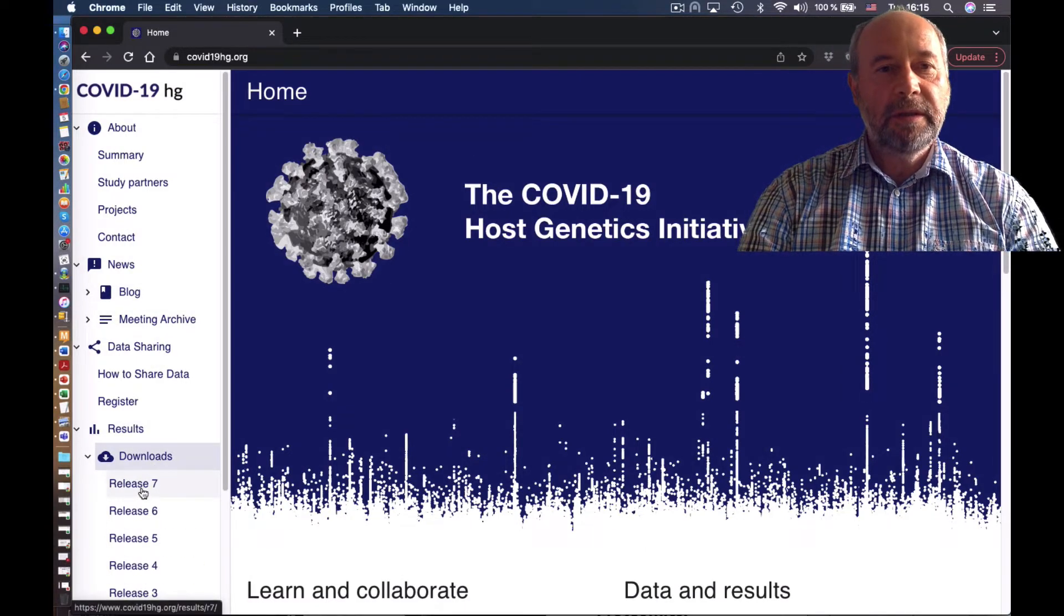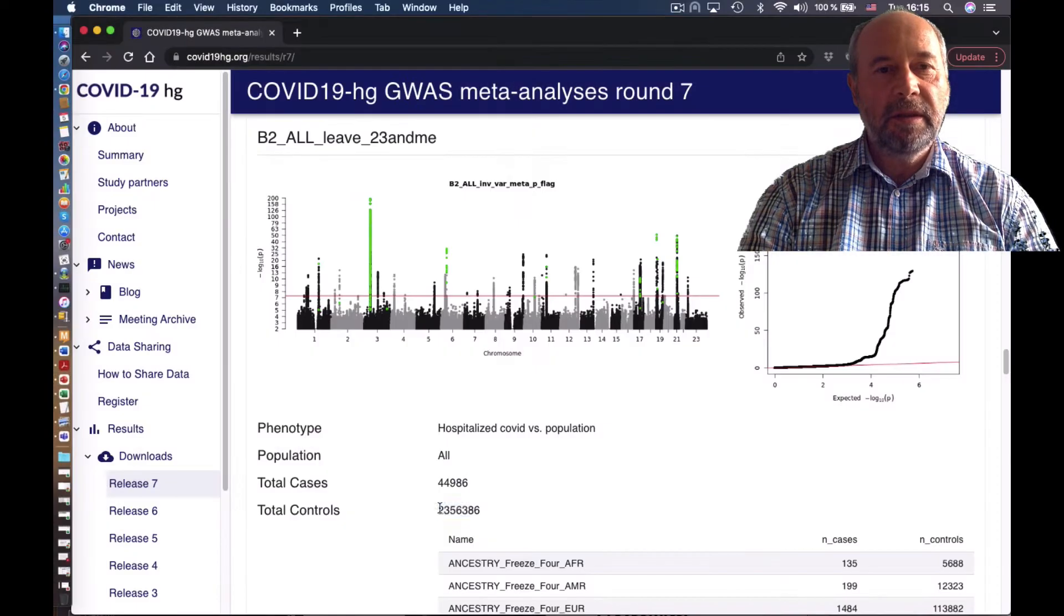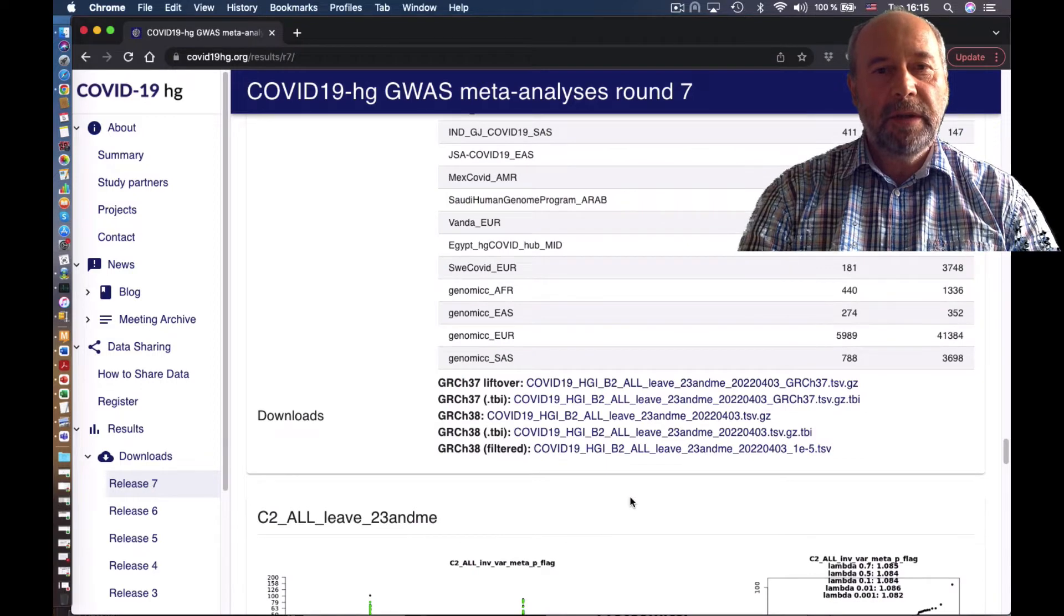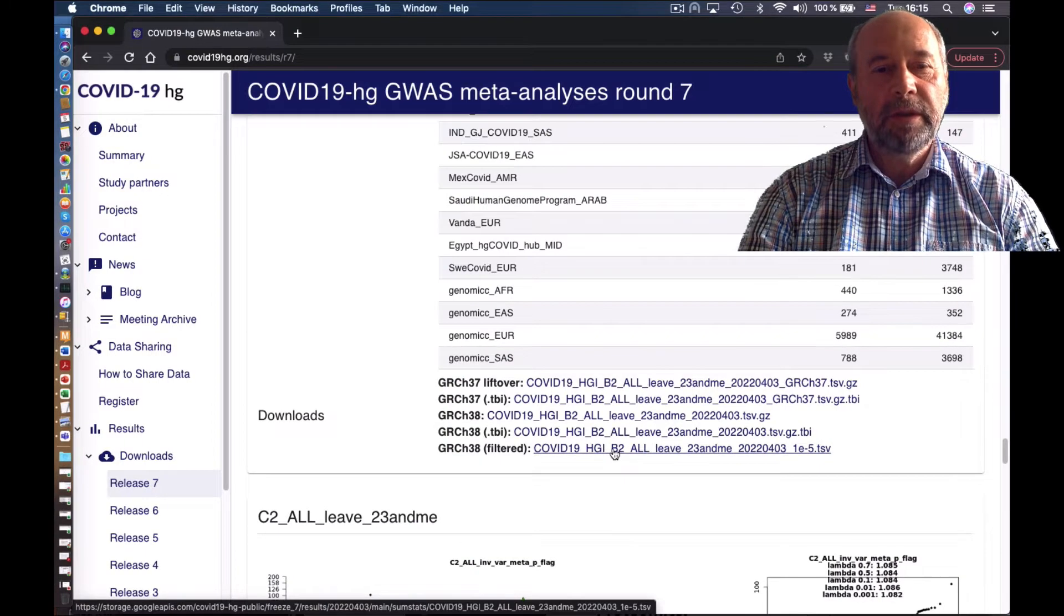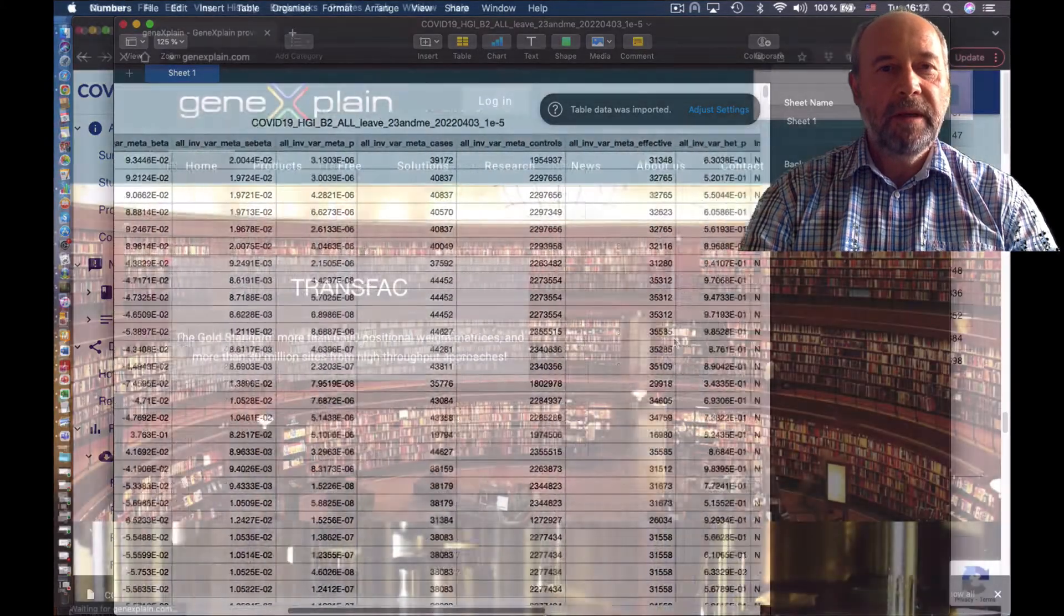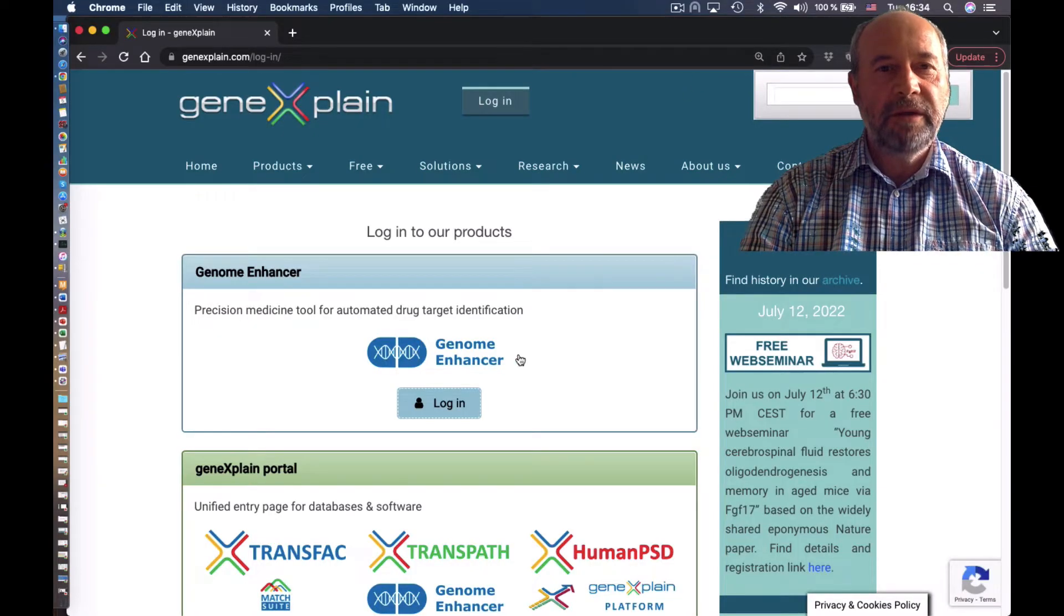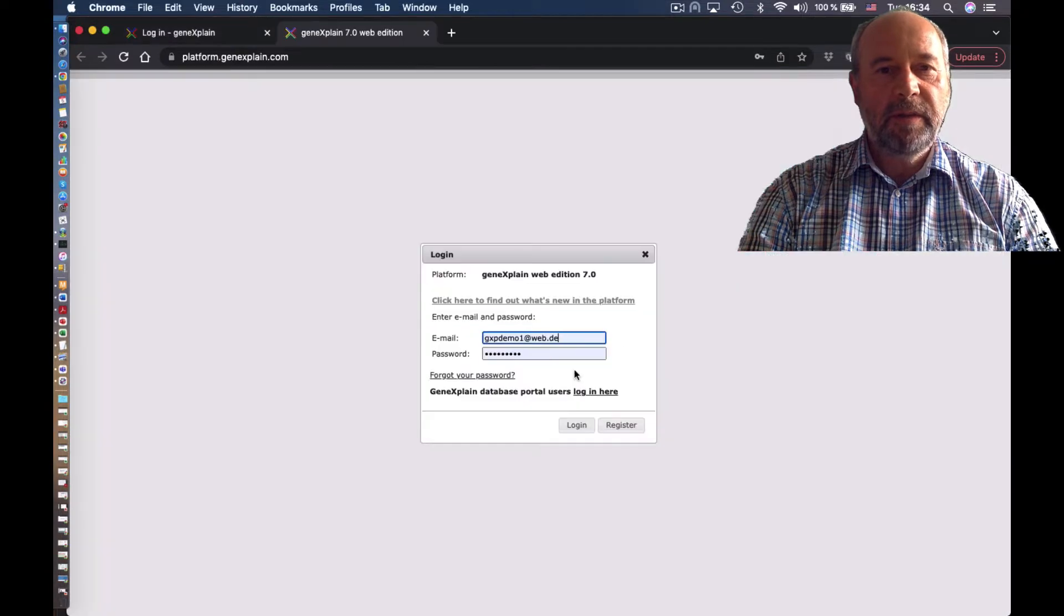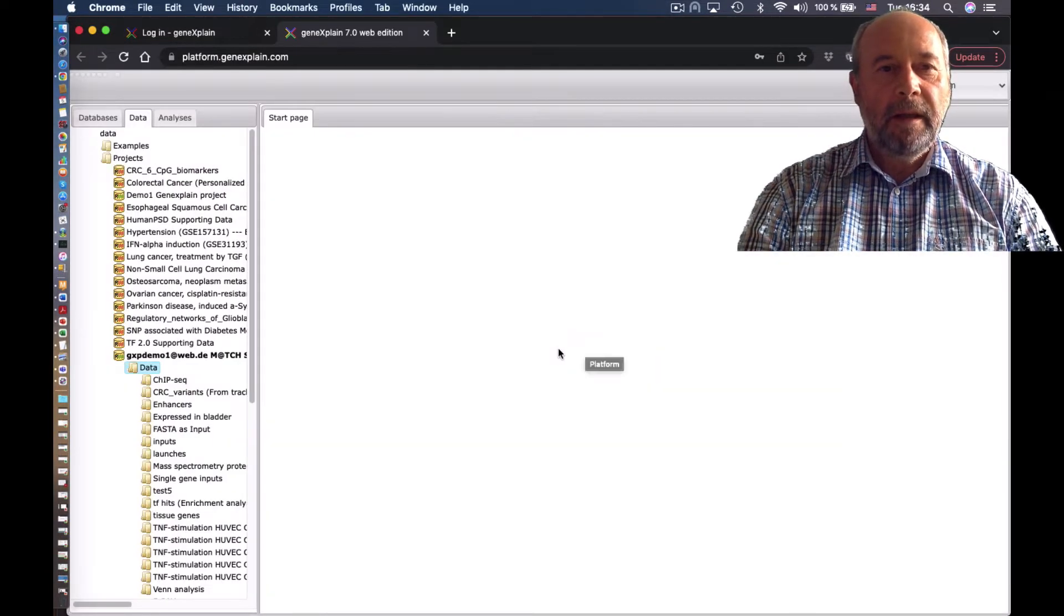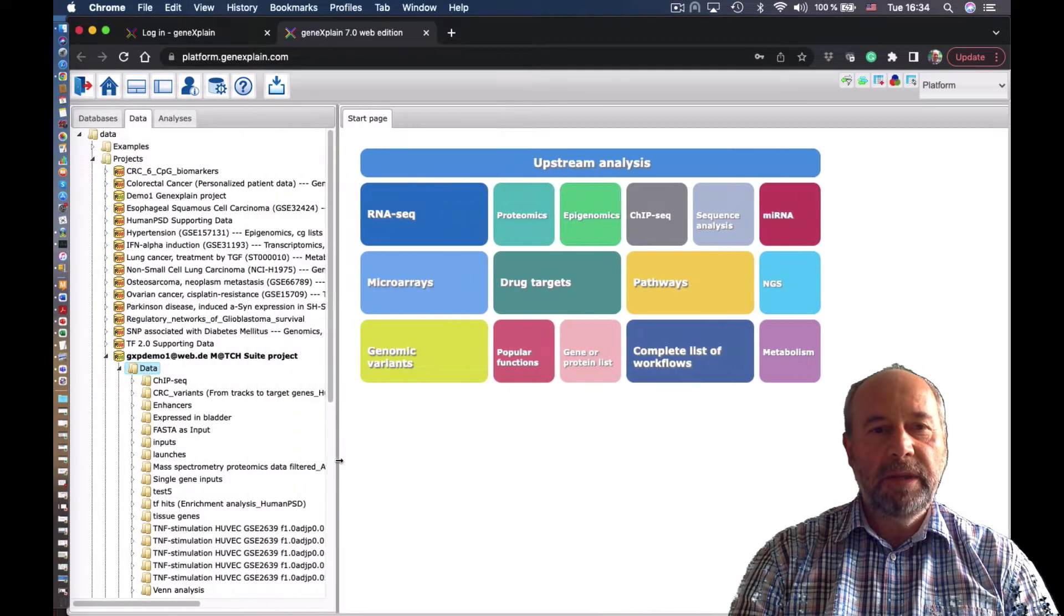So if you look at the SNP database, we definitely see this position, this SNP. We can download this data from this database and put it in for analysis into our platform. Basically, we use Transfac, we log in, and now let's have a look at Transfac Professional.